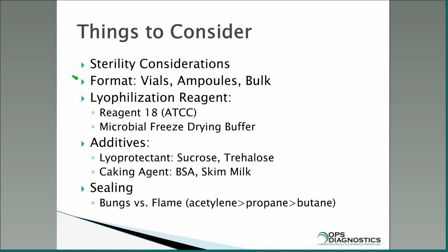The other thing is the format. Are you going to use vials, which are glass vials that are stoppered with bungs, or are you going to use ampoules, which are sealed under a flame? You can also do bulk freeze drying in a bell jar. I'm not going to talk about that today, but that's just a bulk method. You need to know what kind of solution or buffer you're going to freeze dry your material in.